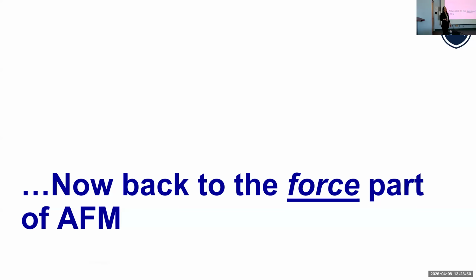And there are beautiful images on the internet that people collect with AFM, and I just showed you some stubby rod-shaped particles. But it wouldn't be my work. So I encourage you to look at the different imaging modes and some of the beautiful art that is made by AFM. But I also caution you that getting really high resolution, beautiful images, it does take time. And in the old days, they said like at least a week of work for one publishable image. AFMs are so much better now that that's not at all true, but still it's not 5 minutes. It's at least an afternoon or maybe refining your sample prep, right?